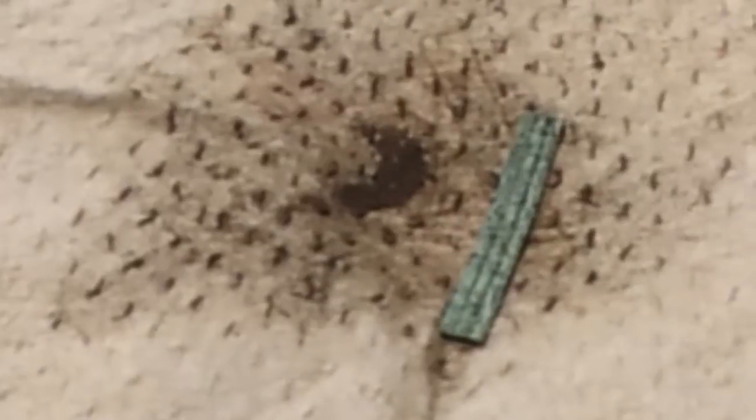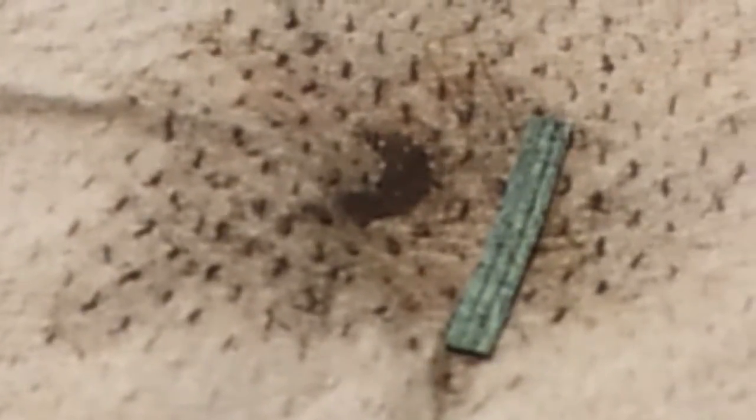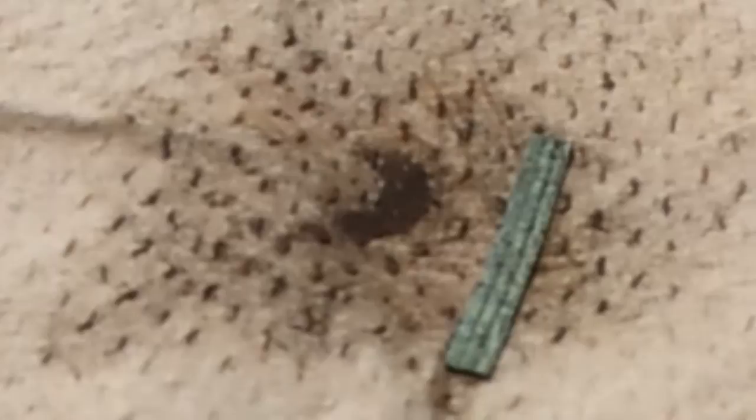Then we have our magnesium, which was only left in for 15 minutes. This one was the one that we actually got out. It actually plated itself in copper, corroded the copper, and then formed what I think is a sulfate precipitate, since it doesn't look like any copper precipitate I've seen.